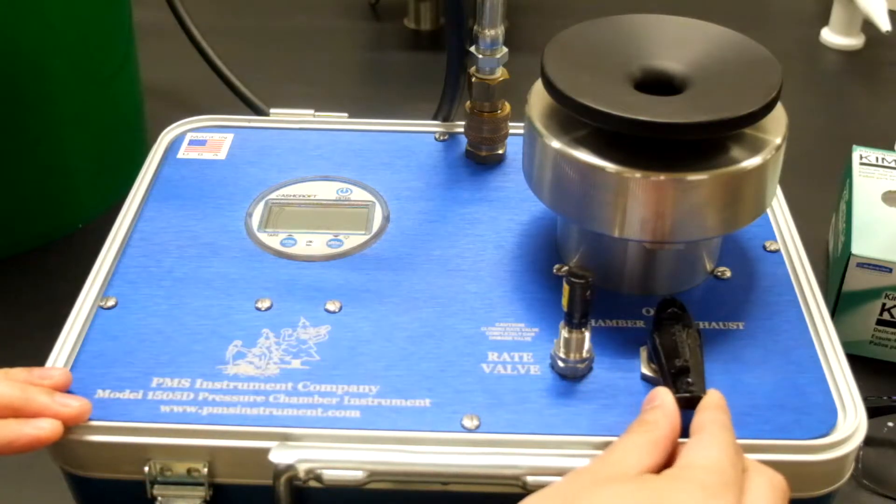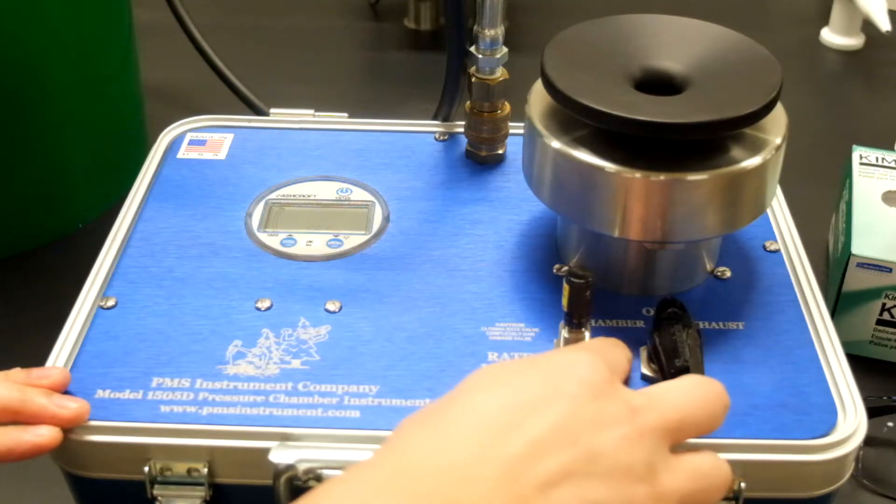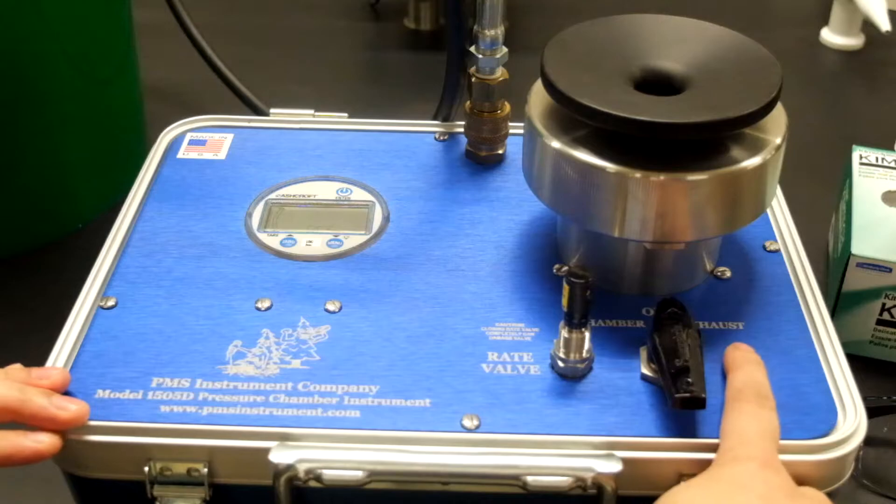On the right we have the valve that controls the direction of the nitrogen gas either going to the chamber or the off position or to the exhaust.